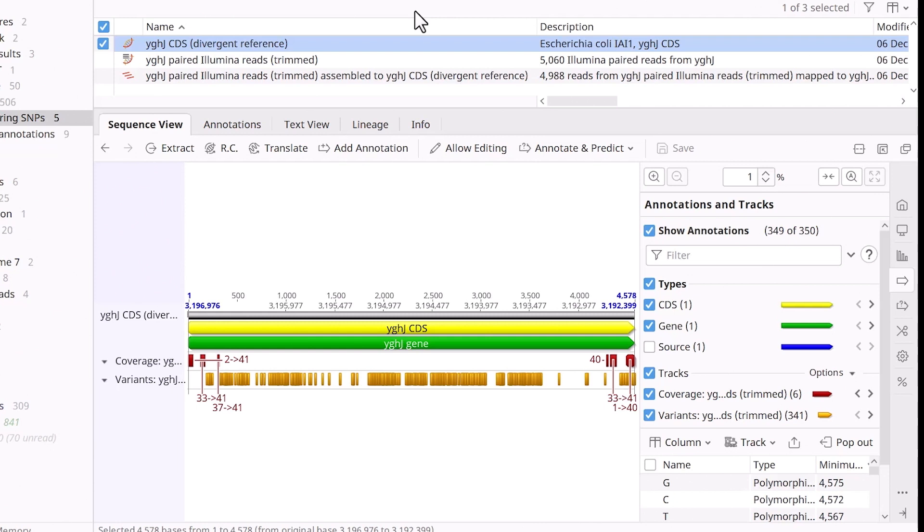Refer to the Explore Contig Documents video to learn how to produce a coverage track like this.